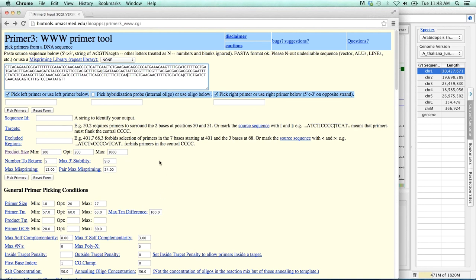Okay, now as you can see, Primer3 has many, many options. We're not going to change any of the default options for today. But if you need to, there are things like Primer Size, Primer Melting Temperature, GC percent. So there are many options. Okay, so in order to get our primers, I will click on Pick Primers.